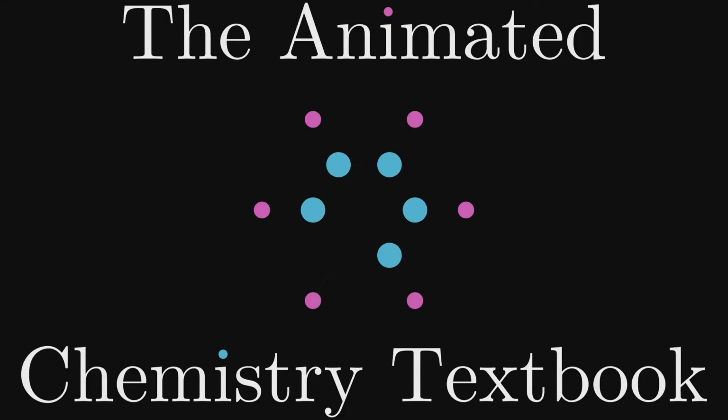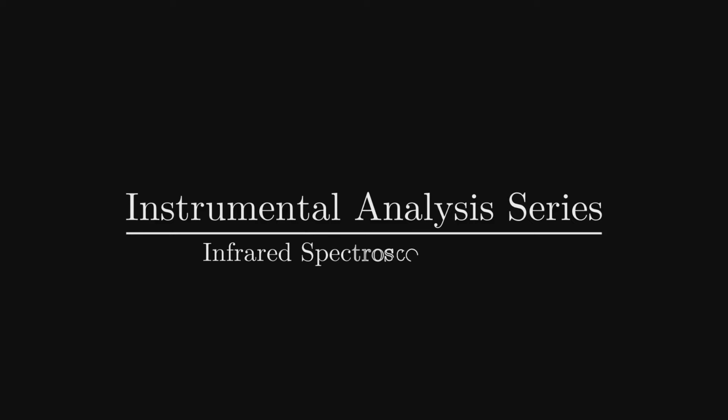Welcome, fellow chemists, to the third video in the instrumental analysis series on infrared spectroscopy. In this video, you will be presented 4 practice spectra along with the various molecules that may have produced it. It is your job to choose the correct one.